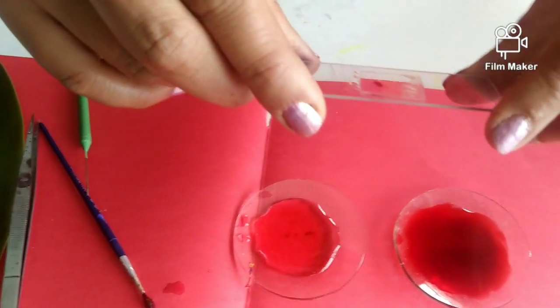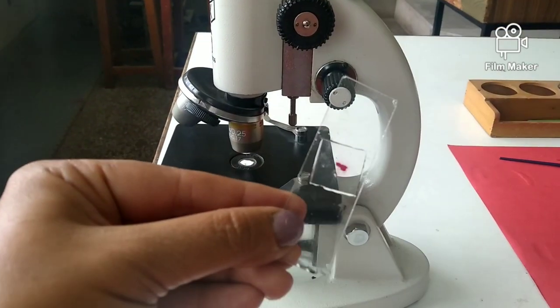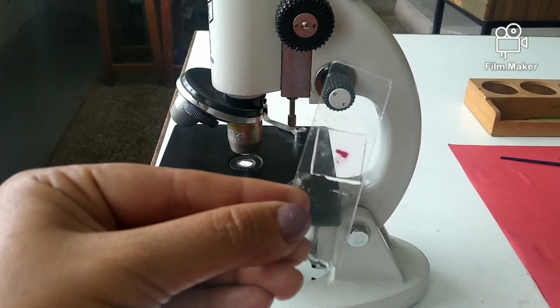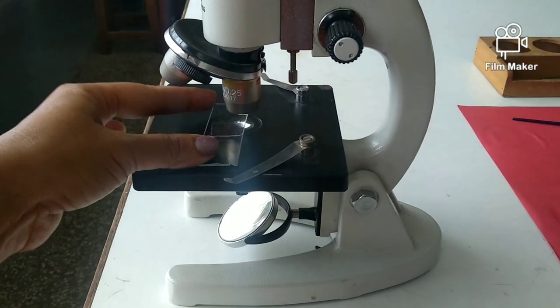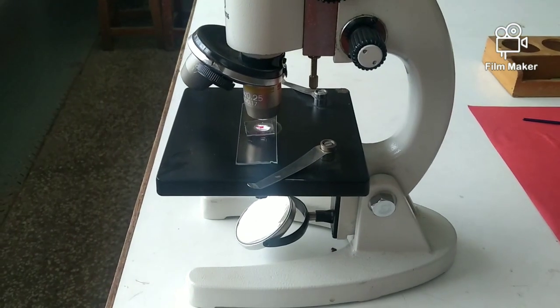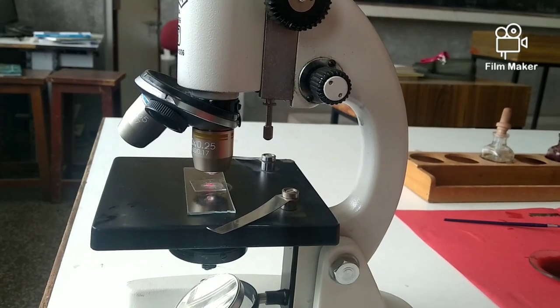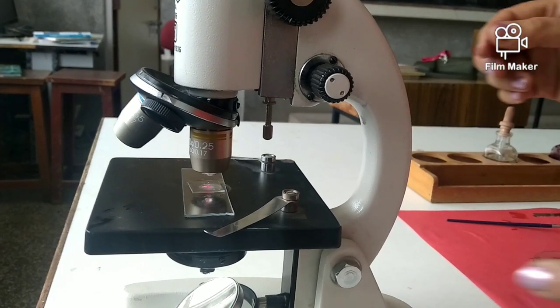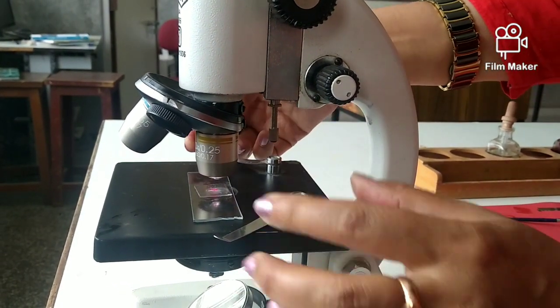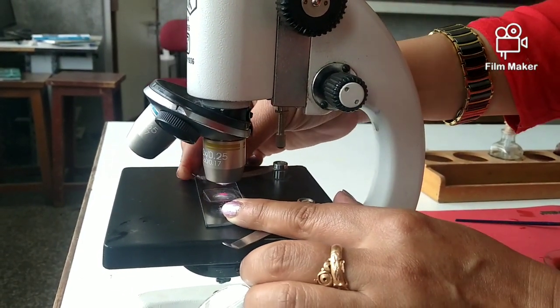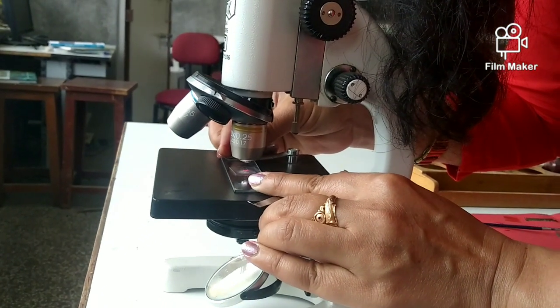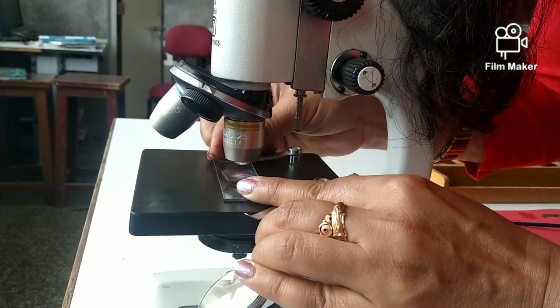Now this slide is almost ready to observe under the microscope. Let's examine it. We have to adjust the lens of the microscope so that a clear image can be seen.